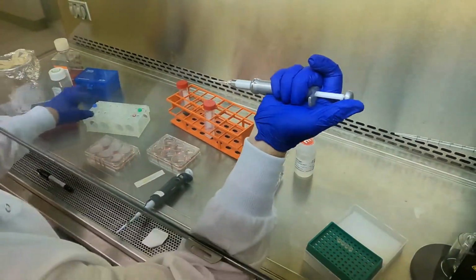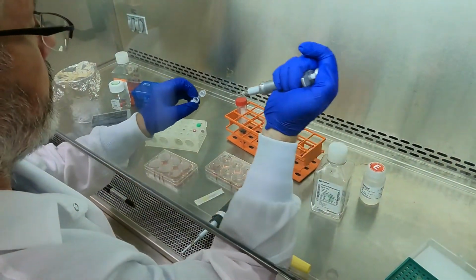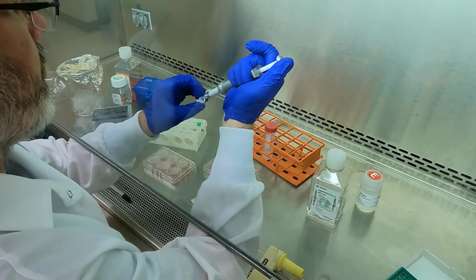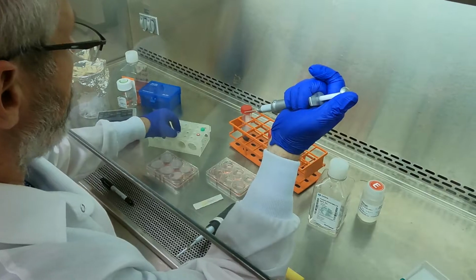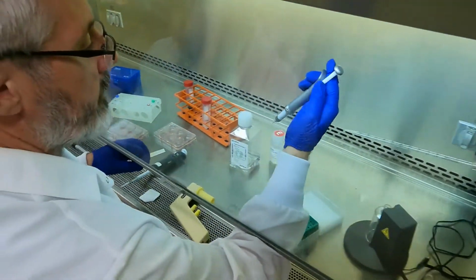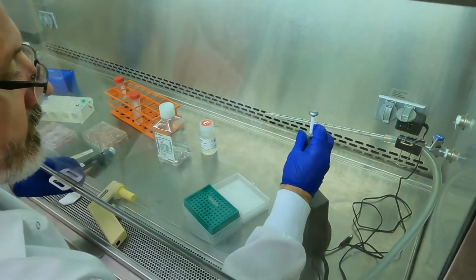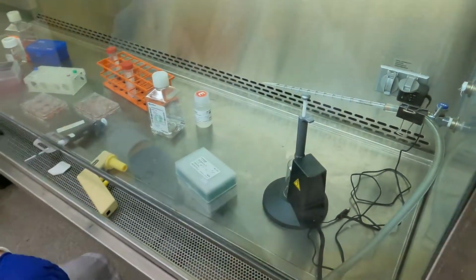Now, what we're going to do is take up 10 microliters without getting a bubble. Be tricky. Like that. Because that's a mixture of your CRISPR Cas12a and your cells. And you pop it in like this, right down, and then press the button.